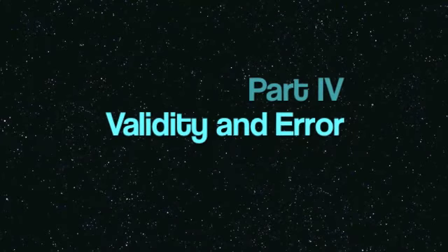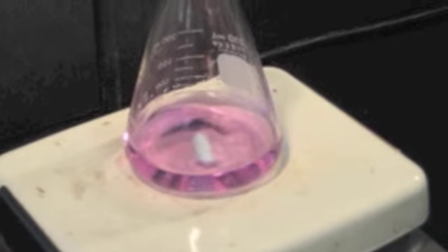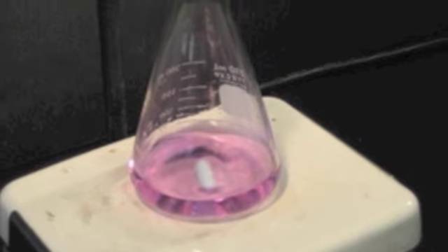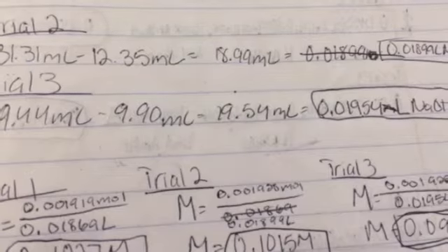There are many possible errors that can occur during this experiment. One error is under-titrating the solution. If the solution does not turn a steady light pink color, it has not reached the equivalence point and is under-titrated. This will cause the total volume of NaOH used to be less than it should be. This will cause the calculated molarity of the standardized NaOH to be greater than it should be. This will then cause the moles of unknown acid present to be greater than it is and the calculated molar mass of the unknown acid to be less than it is.